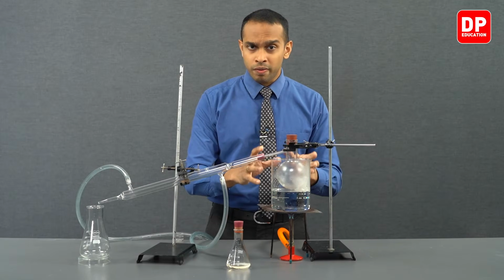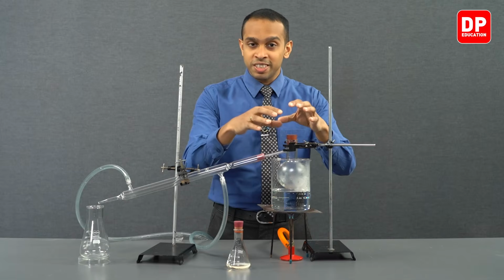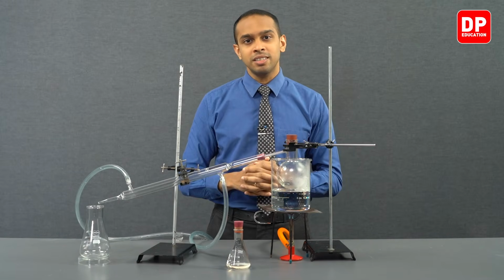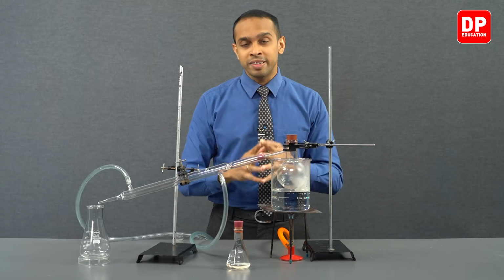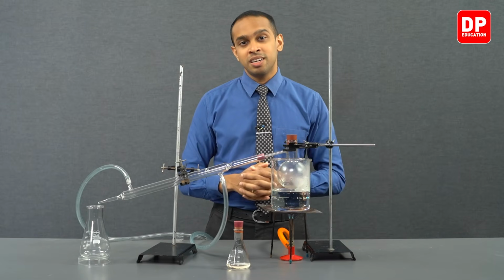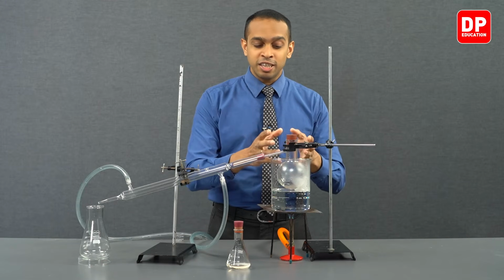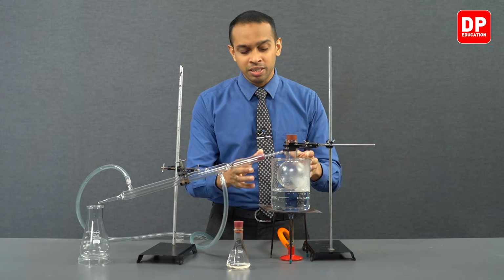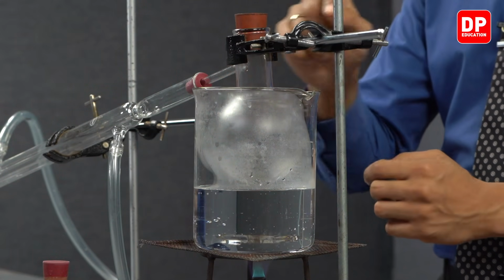Since the heat is provided through steam, the highest temperature that you can observe within this distilling flask would be 100 degrees Celsius. And that temperature is enough to boil our diethyl ether layer. However, it is not a temperature that is high enough to boil our essential oil that we have here. So you will see at the end of this experiment, the essential oil will be contained in this distilling flask.